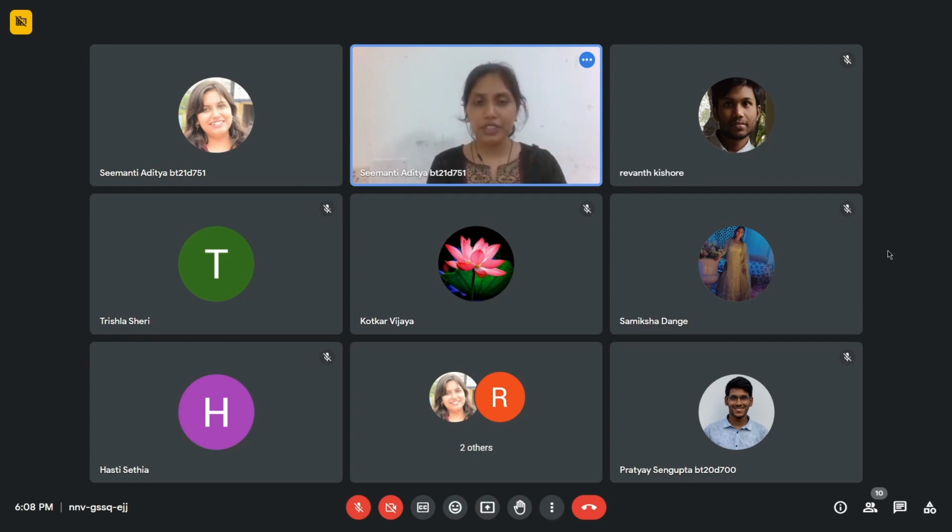Then we should have a refrigerator storage area. In the last classes we did not talk much about refrigerators, but they are very important for cell culture, for storing the chemicals: the media, the transfection reagent, the plasmids that we transfect inside the cell, or whatever other nutrients or treatments we want to give to the cells, like some drug treatment.